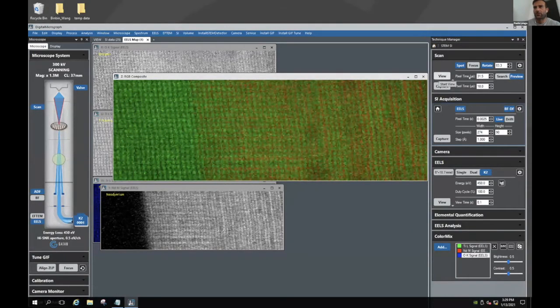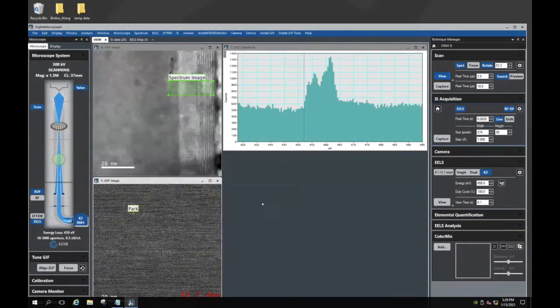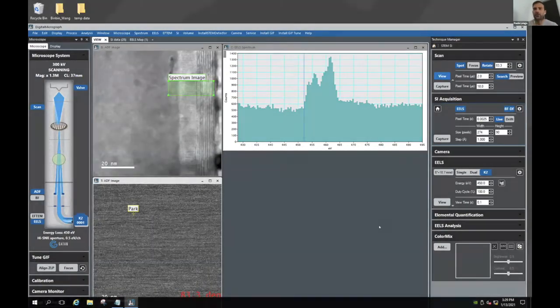What about we do this in a little bit better way? Paolo, you did it very quickly. I just wanted you to show them where the option was to bin the data in the Z direction. Okay, I'll do it again and I'll show them.